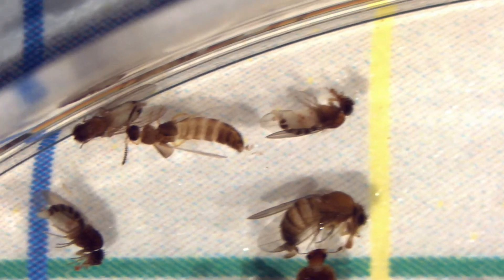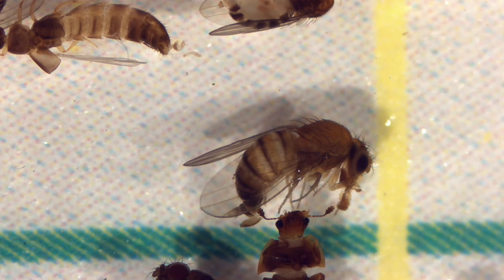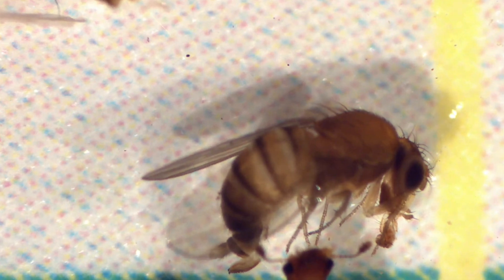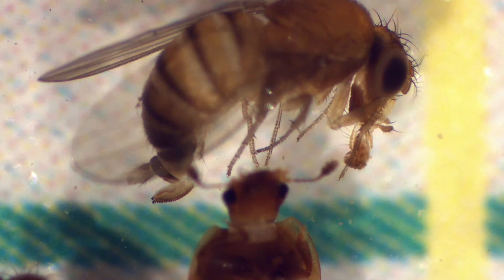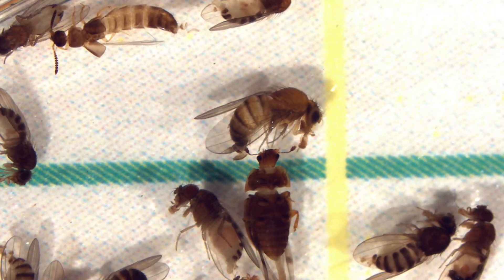We'll take our sample, take our petri dish, give it a swirl, dump it in, and then start counting. If you think of the petri dish as a clock, I'm starting at 12 noon and working my way right to left in the upper left quadrant. I'm panning back and forth — I think this is a female. I'm zooming in a bit more; I really want to focus on that ovipositor. You can see the teeth of the ovipositor, which confirms that is a female spotted wing drosophila.